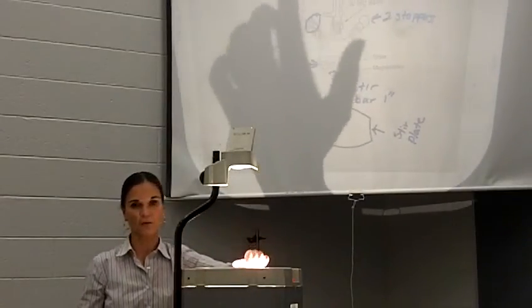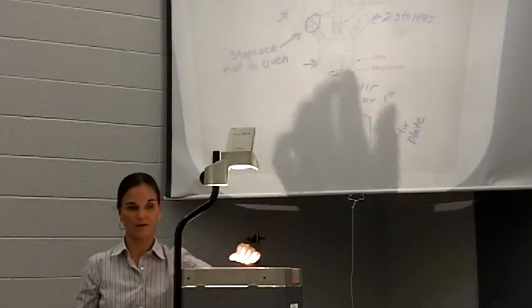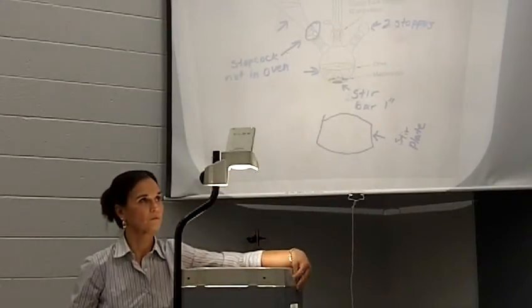So be very careful with this setup and follow the instructions very carefully. Okay. All right. So then when we get done with adding our alkyl bromide, we still need to keep that, we want to keep a reflux in that flask.